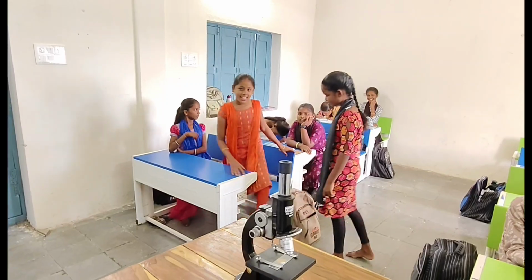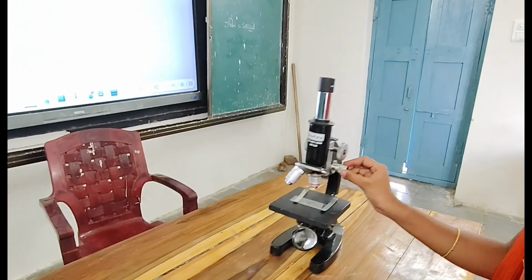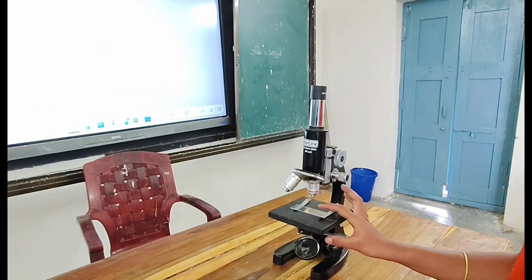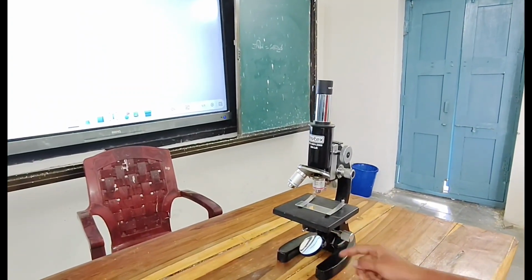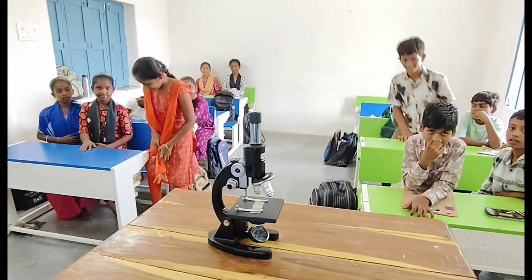Aradhya, come. This is eyepiece, tube, coarse adjustment, fine adjustment, arm, objective lens, stage, clip, slide, condenser, reflector, base, arm. Very good. Go. Next, Manadeep, come.